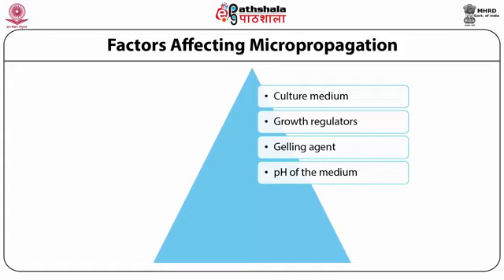The other thing you should be careful about is that pH of the media also changes while the cultures are growing. So that's one of the reasons that you have to keep on changing the media or take them to the fresh media repeatedly. The conditions in which cultures are incubated are again extremely important, because it's temperature and light. I won't say humidity, because humidity you are taking care of in the closed vials. So both temperature and light are to be controlled carefully.